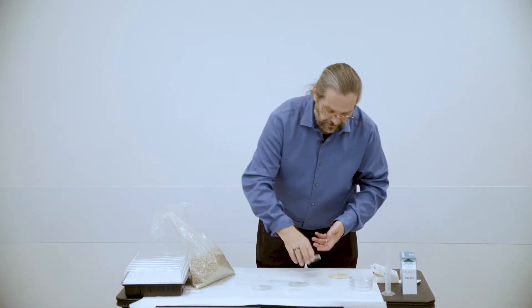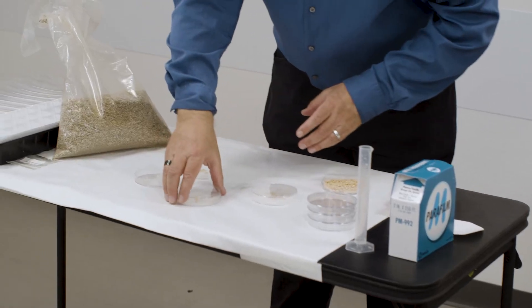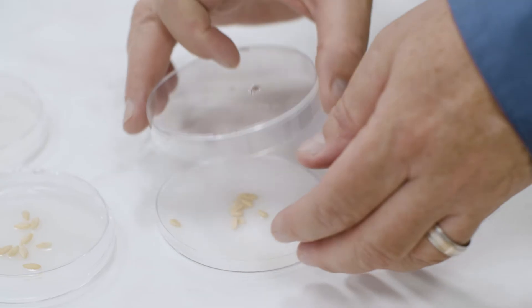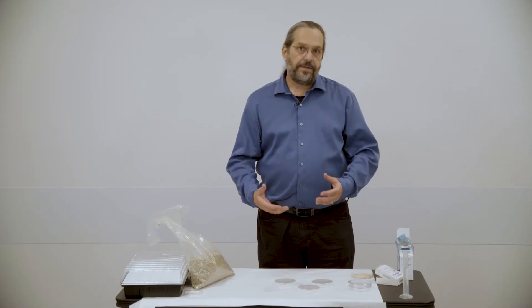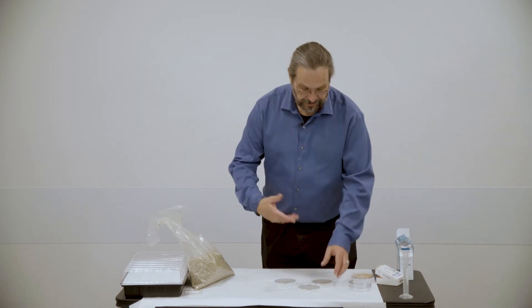So once you get that water in, you get the seeds in, you get the filters together, you're going to go ahead and put the lids on the petri dish. So once you've gotten the seeds into the petri dishes with your solution and the like, this last step you want to take is you want to grab some parafilm and you want to seal the petri dish up.